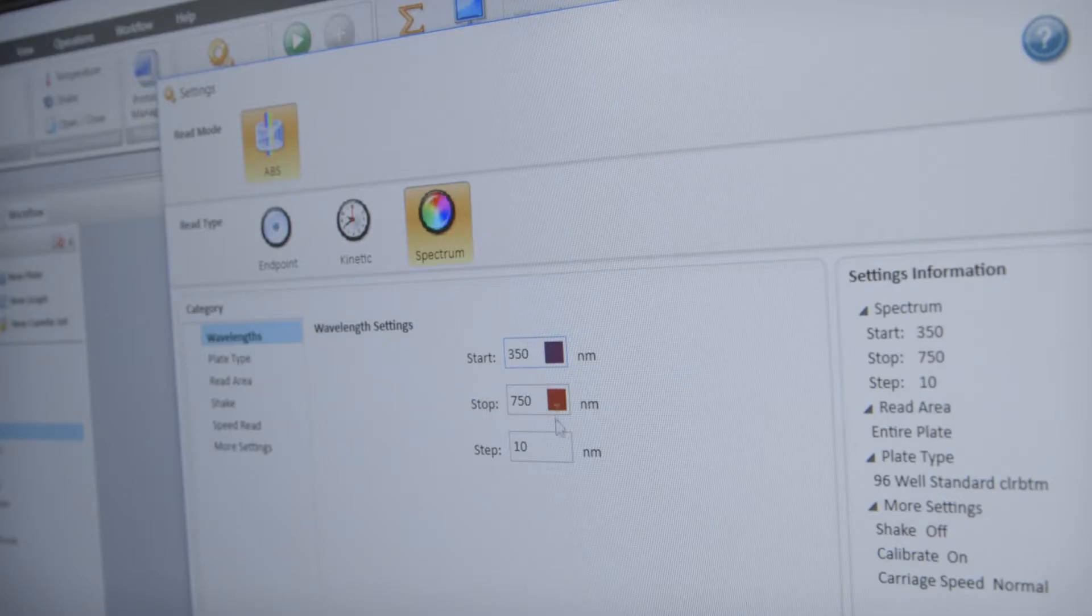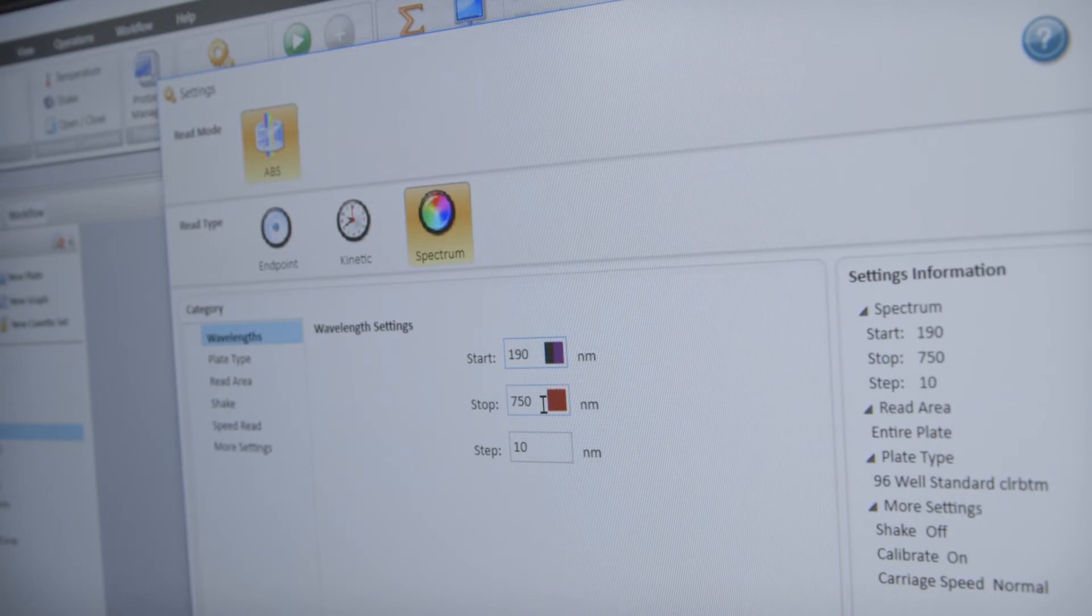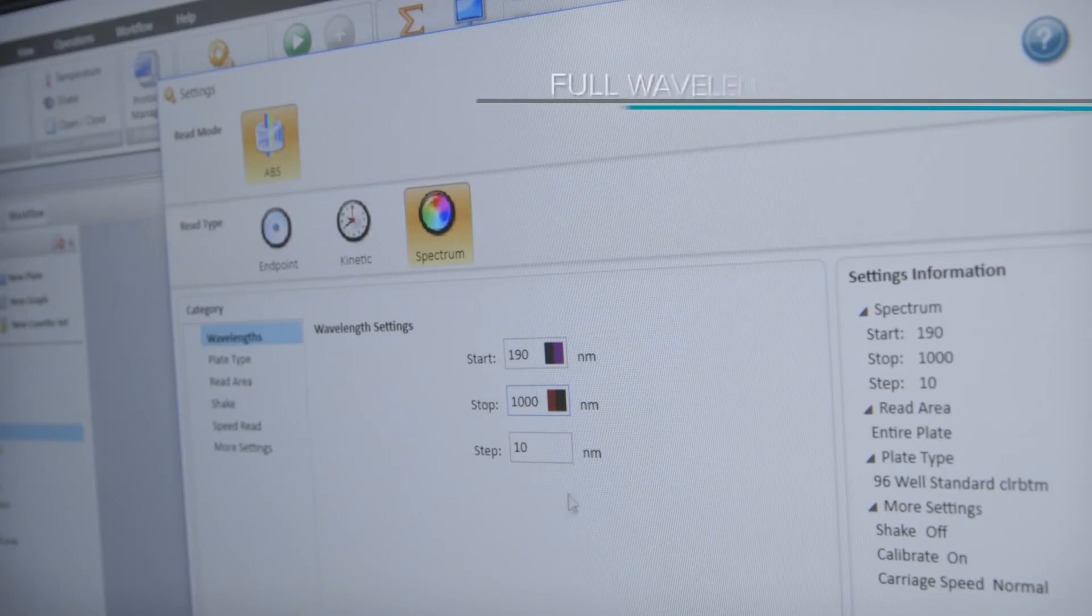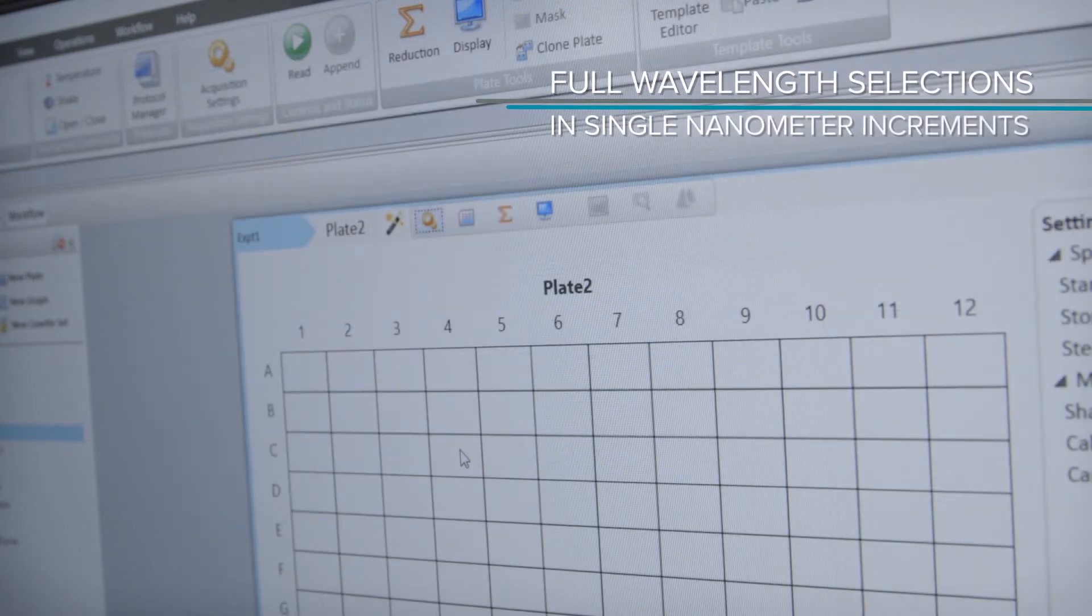The tunable wavelength reader eliminates the need for filters. Get full wavelength selection from UV to visible range in single nanometer increments.